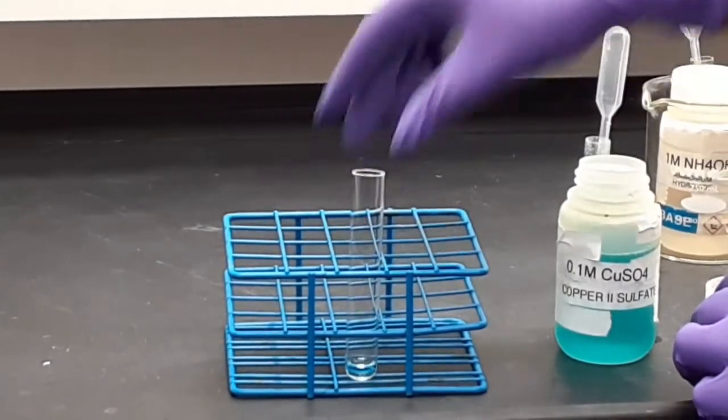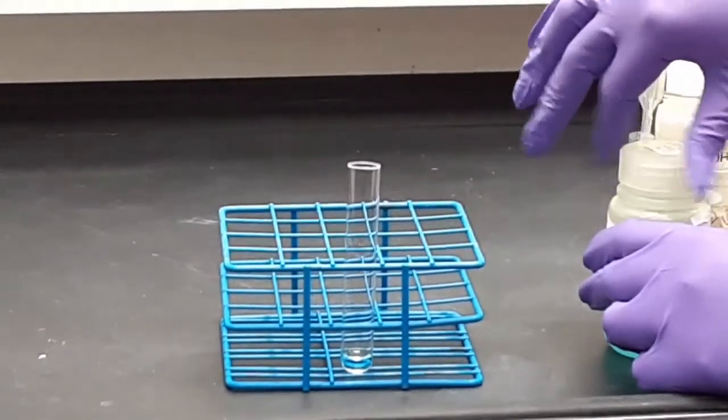As you can see, that's a really pale blue. Hardly any color visible at all at this point.